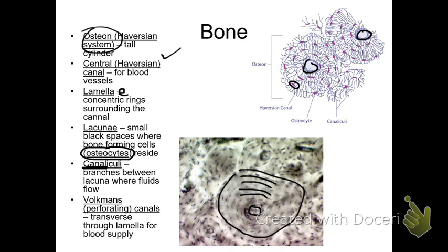canaliculus. But many canaliculi connect these cells one to another. If I blow this up, you can see what look like stress marks that travel in between these lacunae. And those are even better shown up here in this cartoon, labeled the canaliculi. These little lines are little canals, and that allows the cells to talk to each other. We'll deal with Volkmann canals in a future lecture, so don't worry about Volkmann canals today.